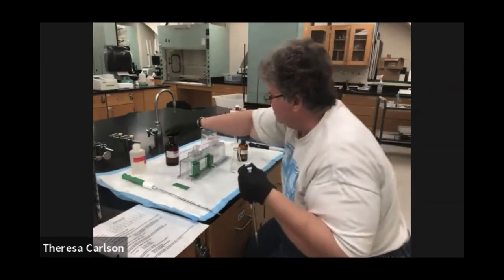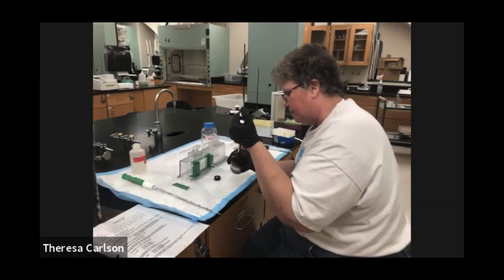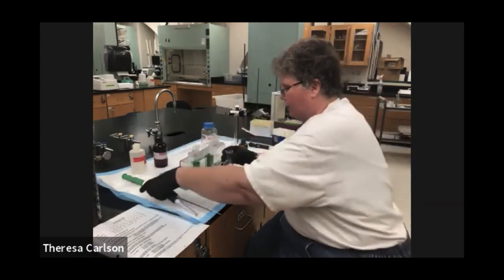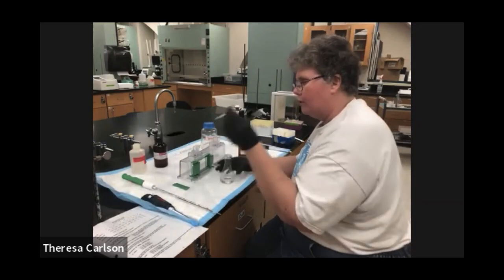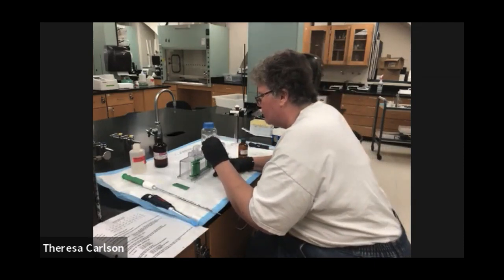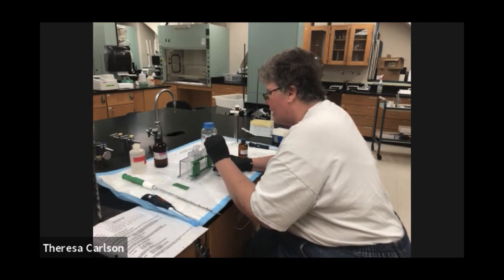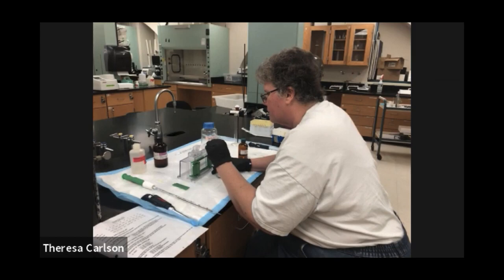So we're going to add our TEMED. Once we add the TEMED, it will start the polymerization process. The acrylamide and the bisacrylamide that's in solution A will start cross-linking. So you need to have everything ready to go that you need to add the solution into there. So we're just going to swirl. After we swirl, we're going to get a pipette. We're going to get a couple mL, and we're going to start adding solution in between the two plates, just pouring it in between the two plates, trying to avoid bubbles, if at all possible. Although we do have a way to take care of bubbles.